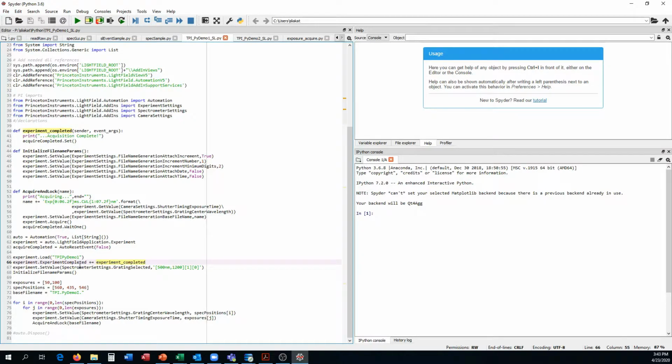So in that same vein, this is a software trigger. So this listener hooking, this is the syntax for what they call hooking a listener. If the event is a trigger, you want something listening for that trigger. It's like on your oscilloscope when you set the trigger level to a voltage that you want, and then you arm it to acquire.